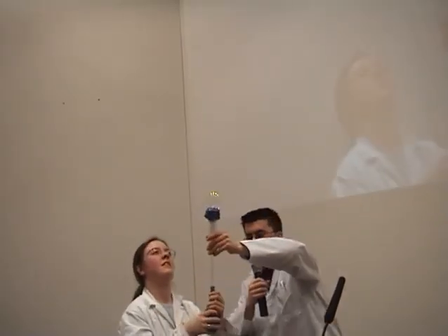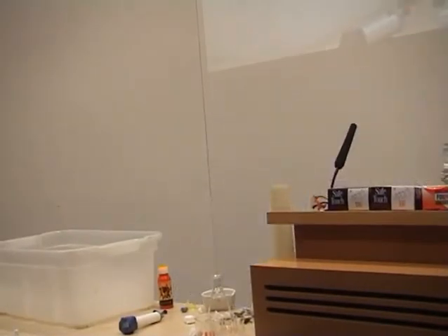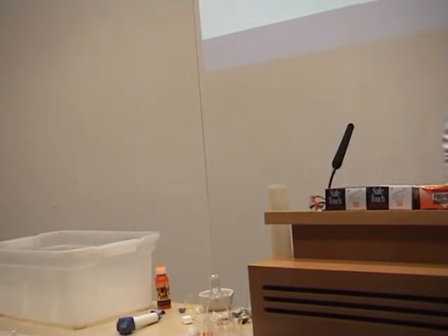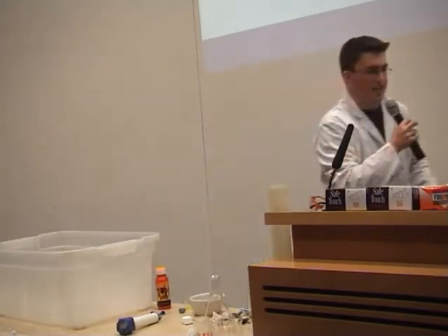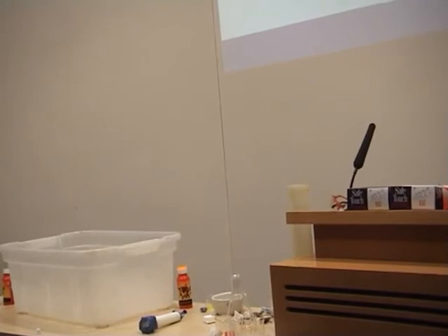Now, move on to a third gas here. Bear with us. Now this group alone were allowed to use a lighter, which mightn't have been the best idea. So we're going to see the effects that different gases have on a flame. See how much fun we can have with this. So we added some bubble solution into the graduated cylinders there.